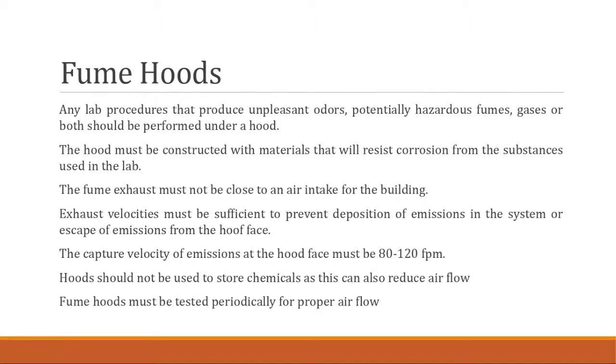The velocities in which these fume hoods operate have to be within 80 to 120 feet per minute. That's just to ensure that nothing is escaping from the hood face.